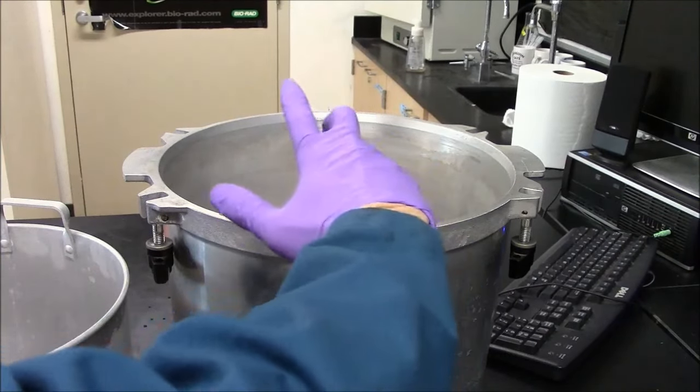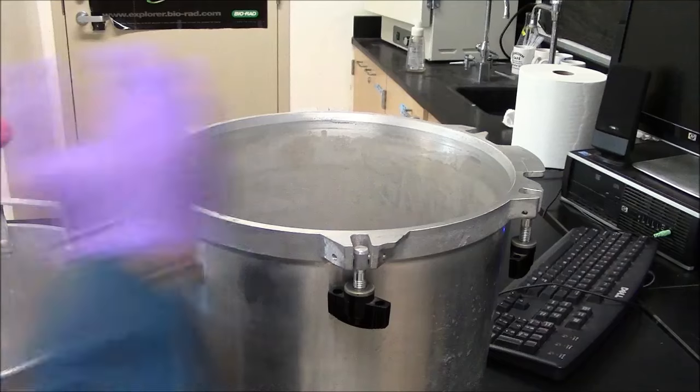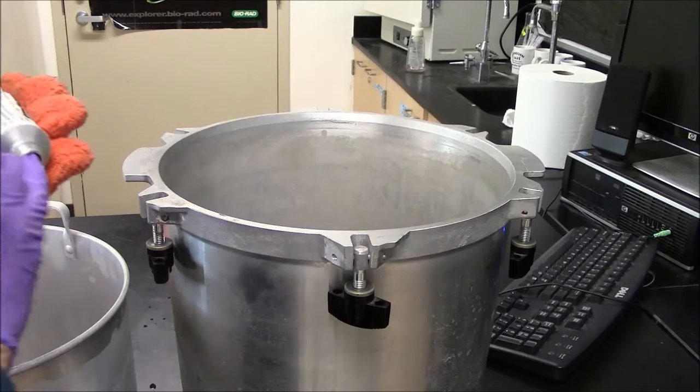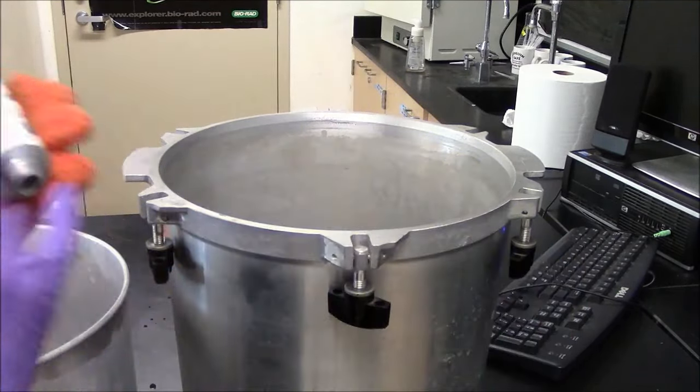To help the seal I can put the vacuum grease around the rim here. It's best to do this when the pot is cold.